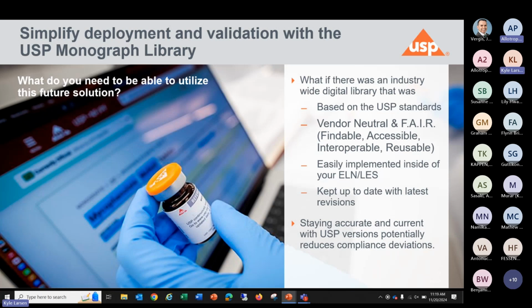The next is the video. So I will probably pause it at one point in the video. The beginning of the video, about 2/3 of it, is really just showing you the accuracy of the transcription, starting with the monograph, going into the ZONTAL tools, making sure the data is correct, and then down into our CDS.